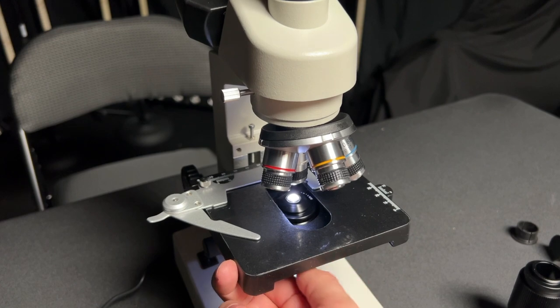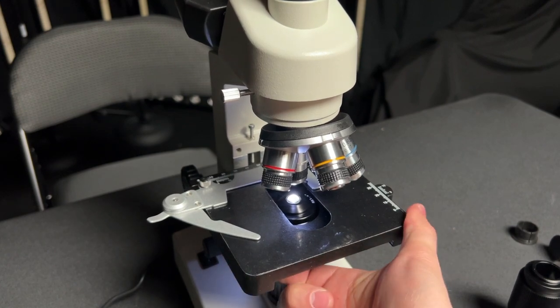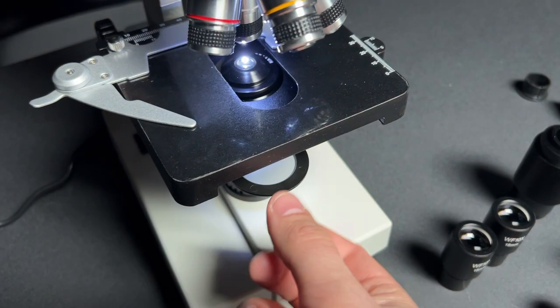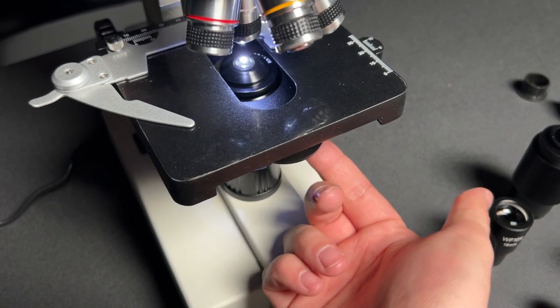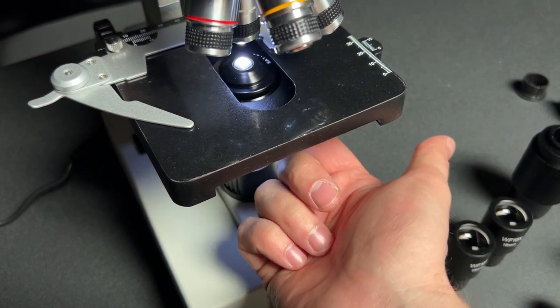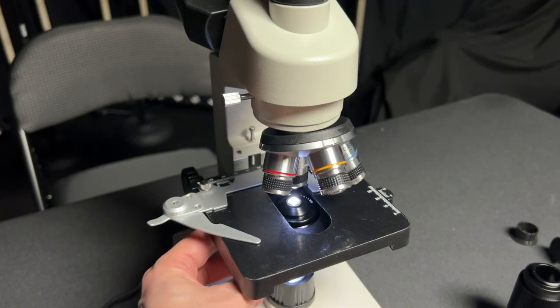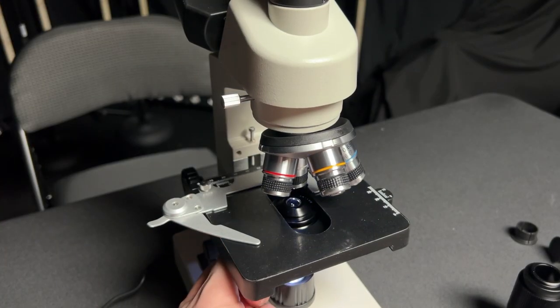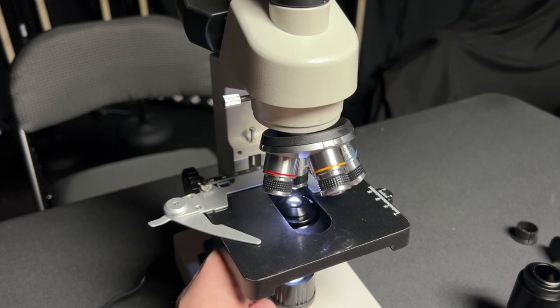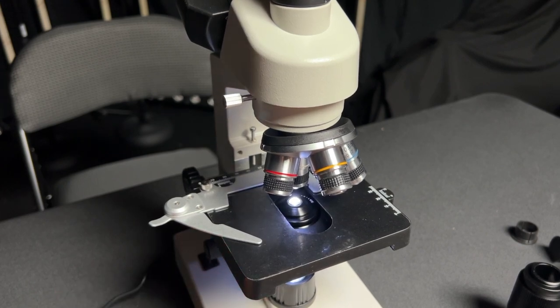There's also a height adjustment at the bottom here which allows you to dial in the light exactly how you want to. Now you can see here there's the frosted glass tray which slides in and out and you'll see how the light is changed as I insert the frosted glass. It just makes it a little bit softer. In addition to that frosted glass there's also an aperture slider which allows you to close out the light all the way or open and close it to get the desired amount of illumination.